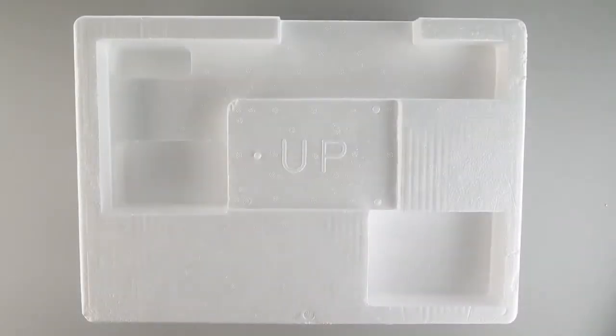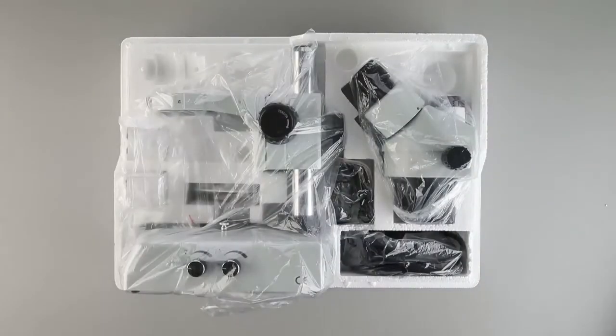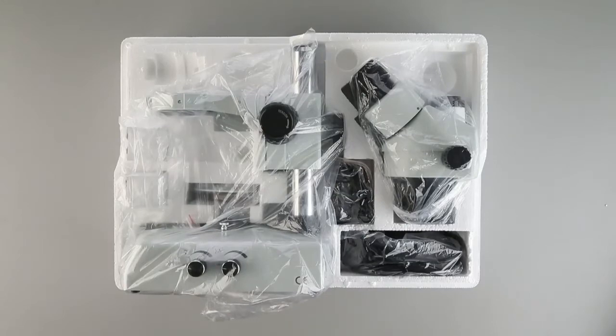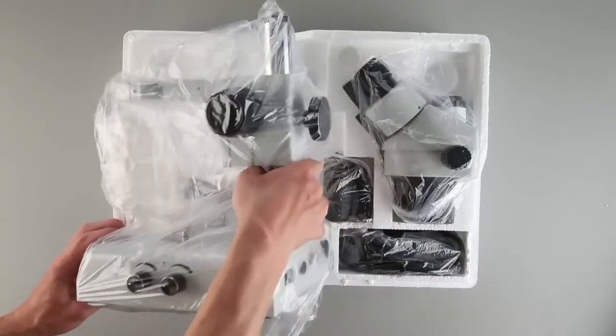When unpacking the microscope, look for the word up or an arrow which designates the top. Inside the box you'll find all the components you need for this microscope, which include the body, a head, a pair of eyepieces, a lighting module, a trinocular port, and various other accessories.